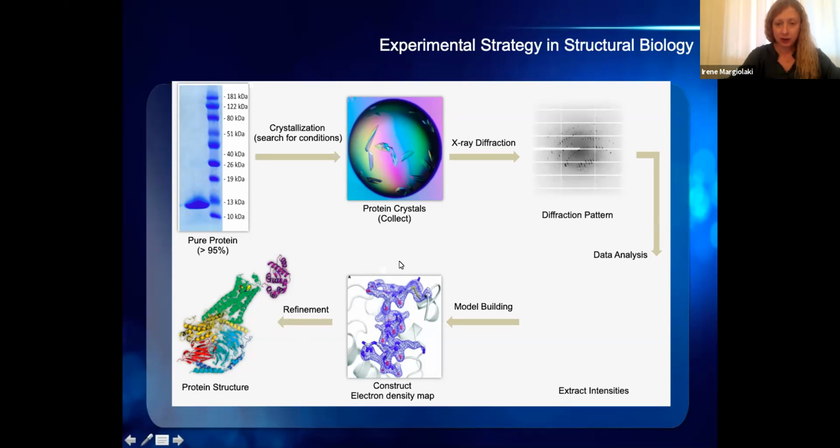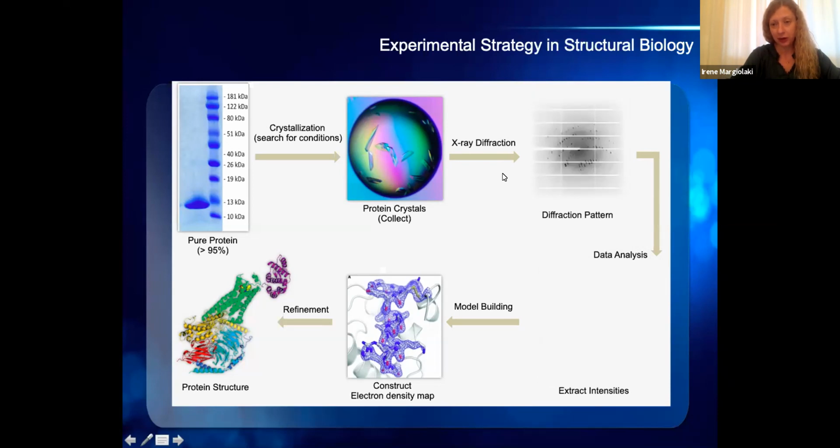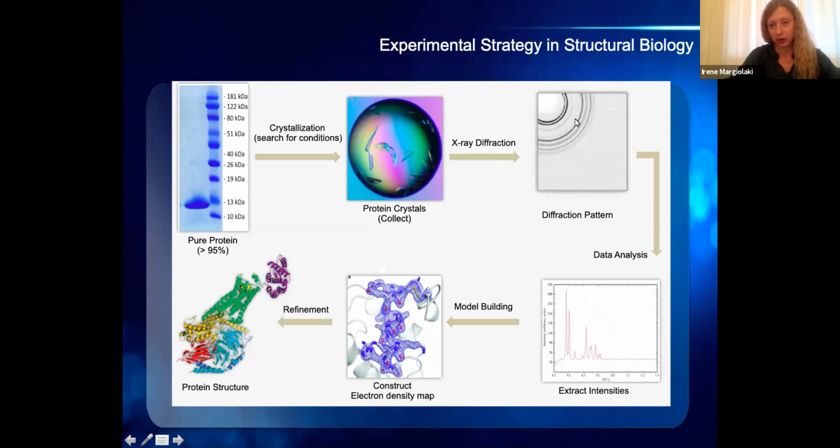So our idea was to replace this data with this data. These are powder diffraction data. The difference is that our sample is not a single crystal, but many crystals which are randomly oriented. And therefore, owing to Bragg's law, instead of single reflections, we have concentric rings that we then integrate the intensity around, and we produce these nice two-dimensional profiles. On the vertical axis is the diffracted intensity, on the horizontal is the 2 theta diffraction angle.